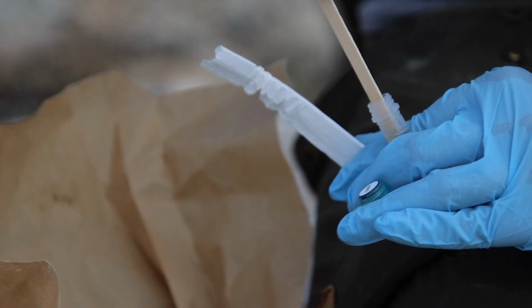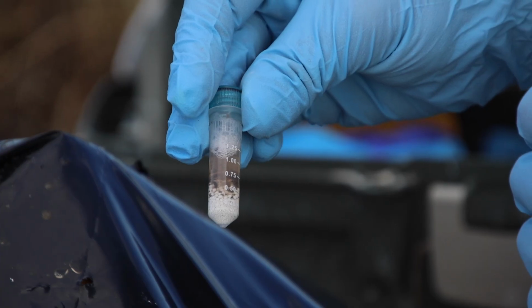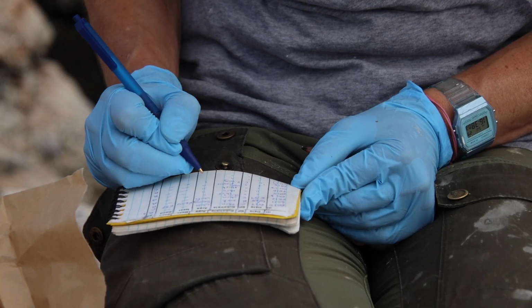We don't need very much, just a pea-sized amount, and that amount can go into the tube. Then you need to give it a good shake to mix the buffer with the poop.